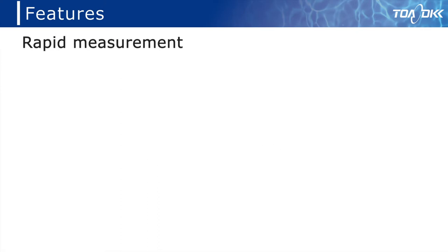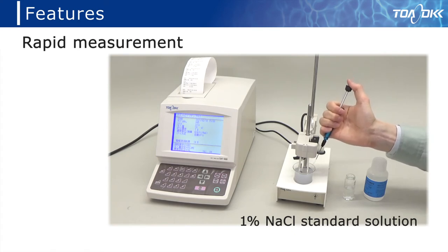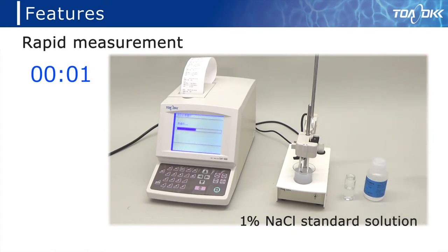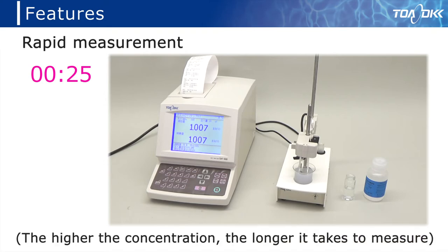The second feature is measurement in a short time. Here is an example of measuring 1% NaCl standard solution. The measured value will count up. With 1% NaCl, it takes about 25 seconds from the start of measurement to print out, and measurement can be performed in a short time.